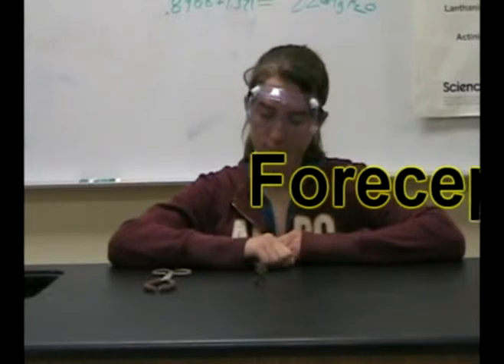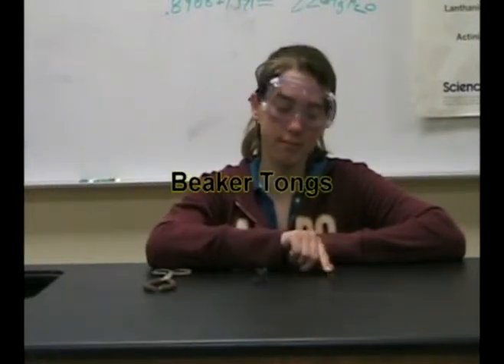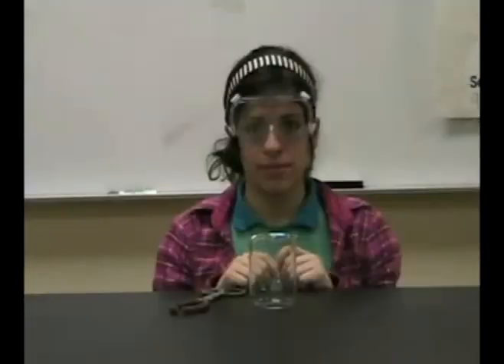Forceps. This is another name for tweezers. Beaker tongs. Beaker tongs are like huge tweezers, used for grabbing beakers and stuff.